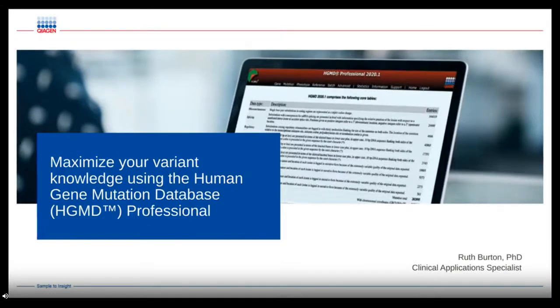Hello, my name is Ruth Burton, and I work for QIAGEN as a Clinical Application Specialist. Today I'm going to talk to you about our database, the Human Gene Mutation Database, and how it can help you to understand and interpret the variants that you have.